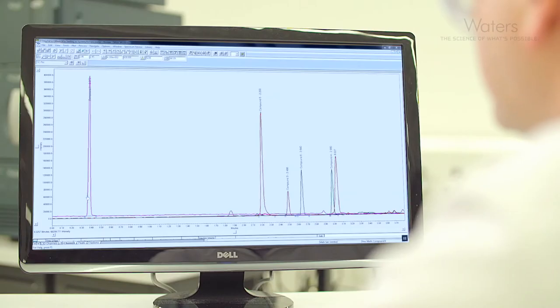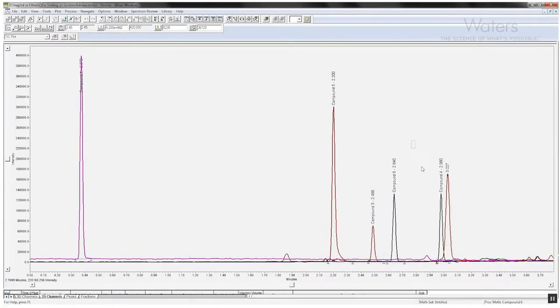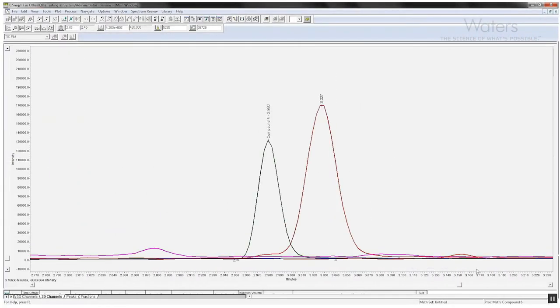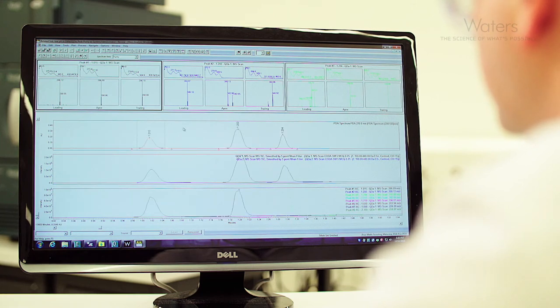Using the Acuity QDA detector will ensure that you are seeing everything in your sample. This is an example of an analysis of sweeteners in which not all of the compounds can be detected using optical detectors. Adding the capability of mass detection ensures that you see all compounds and you can also use the mass data for quantitation. In short, you increase the confidence in your results.